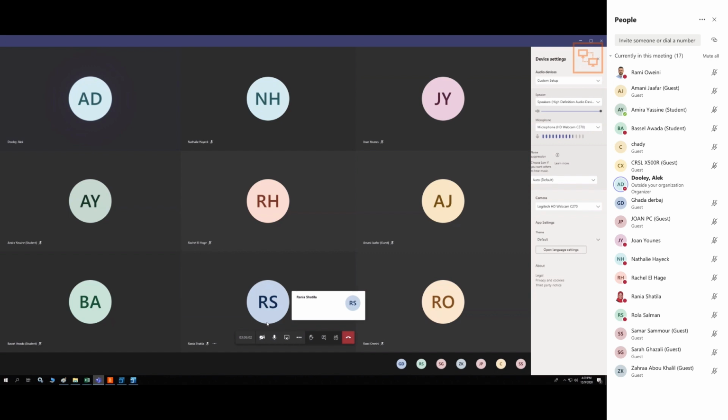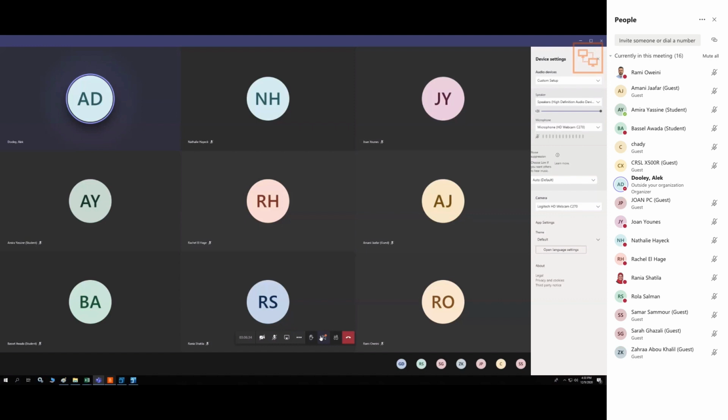All right, guys, listen, I'm going to have to go. So I've made you the batch. So when the purge is finished, just make sure you close the purge valve. And then all you have to do is go to the SCIEX OS and go to the batch and just click submit. And everything should be fine. Sure, for sure. We'll do that.